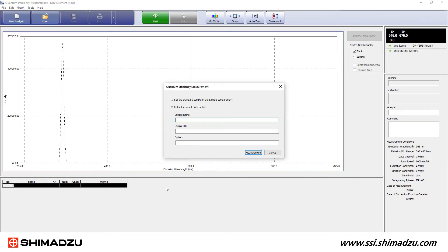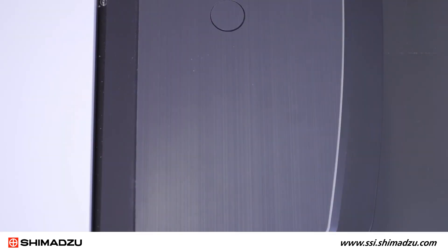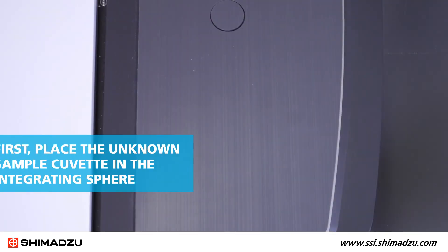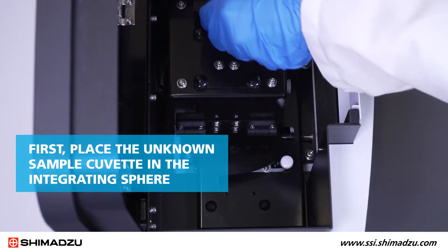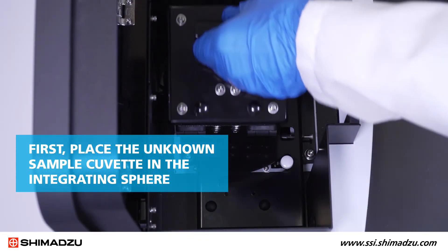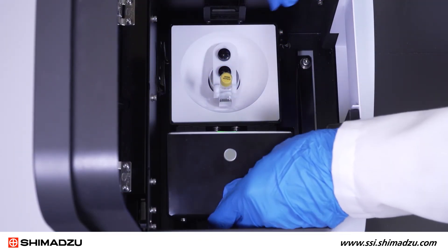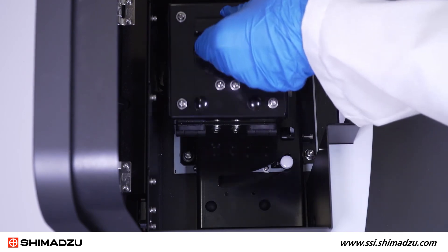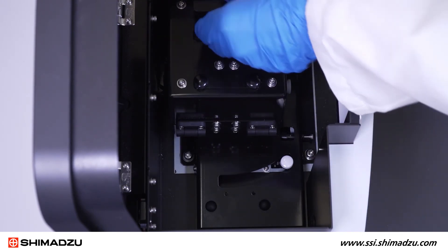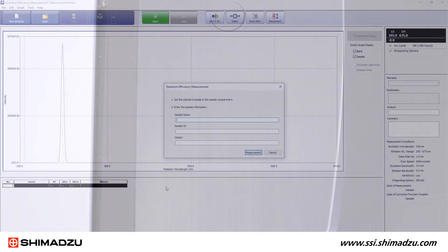After blank measurement, follow the next on-screen prompt to measure the unknown sample. First, place the unknown sample cuvette in the integrating sphere. Then enter the sample information and click Measurement.